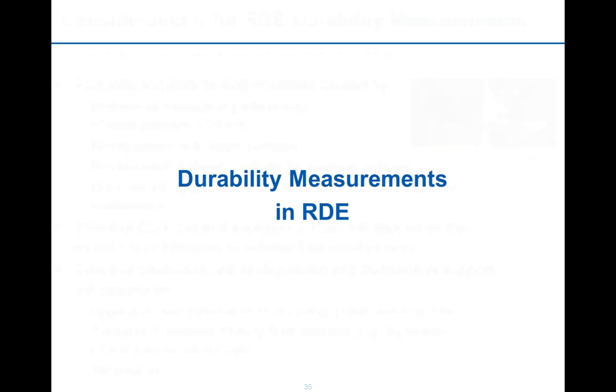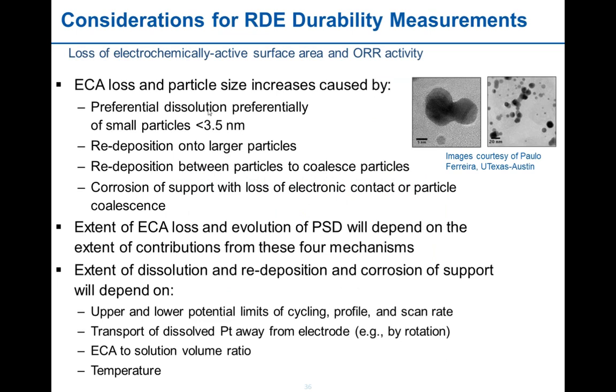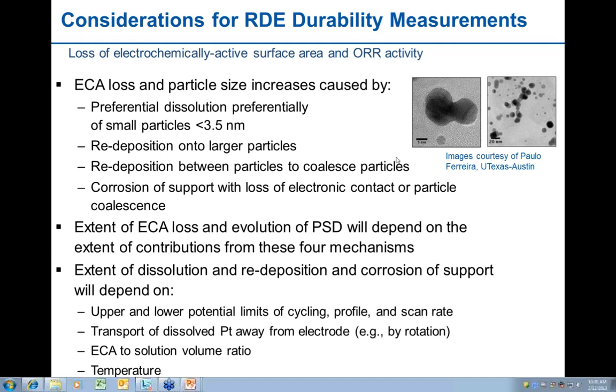Thank you, Shyam. So in this section of the talk, I'll talk about the factors affecting the durability measurements of catalysts and catalyst supports and the protocols that have been developed for platinum electrocatalysts specifically and those supports, both through the Department of Energy's Durability Working Group, and we have a website on the EERE related to the Durability Working Group if you want to know more about that, and also through the U.S. Drive Tech Team collaborations.